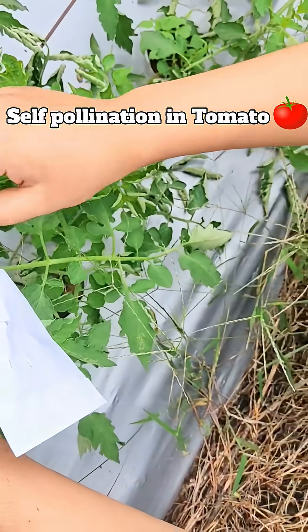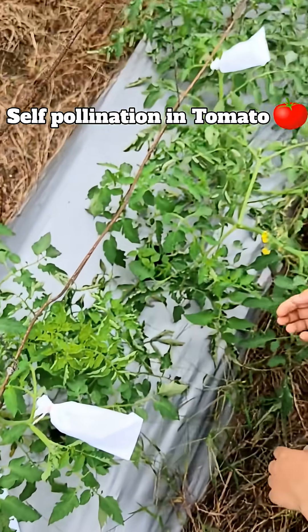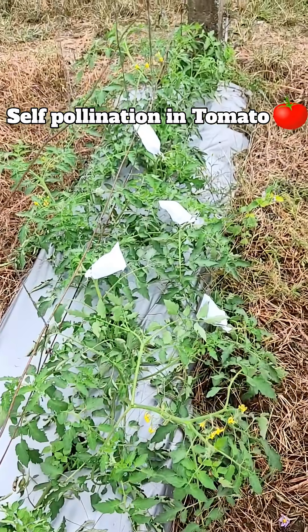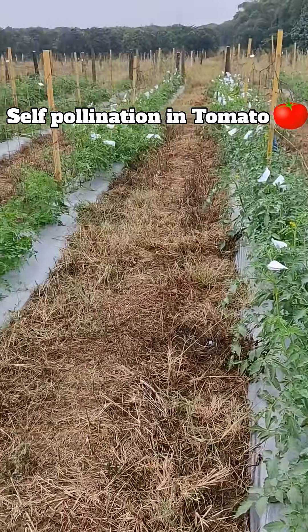Before using the butter paper bag, we have created small holes in it to allow better air circulation inside. Otherwise, if we tie the bag without making holes, the buds will rot and there will be no fruit set. Now, can you tell me which type of tomato fruit — self-pollinated or cross-pollinated — will have better quality?